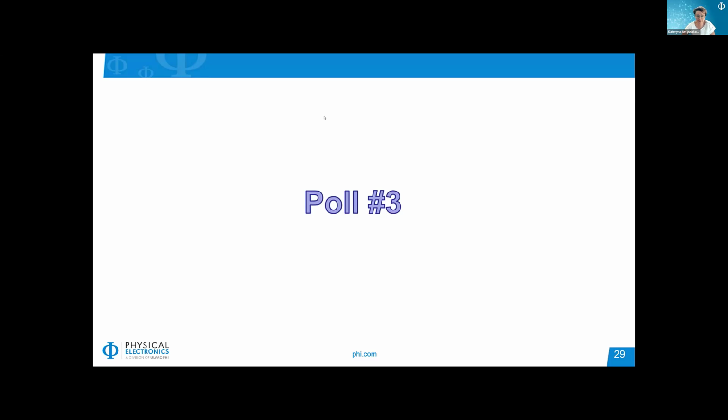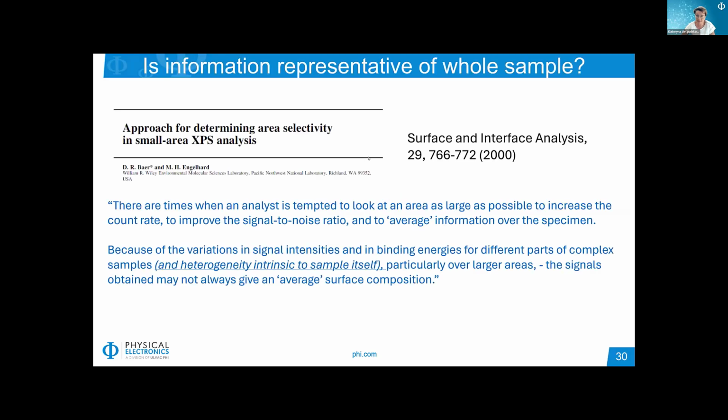Well, thank you for responses. I think the majority of you responded. So let me share the results with you. You can see that the majority of the customers do use small area analysis. And it's very good to see because it's very important for us to understand whether our samples are heterogeneous or homogeneous.